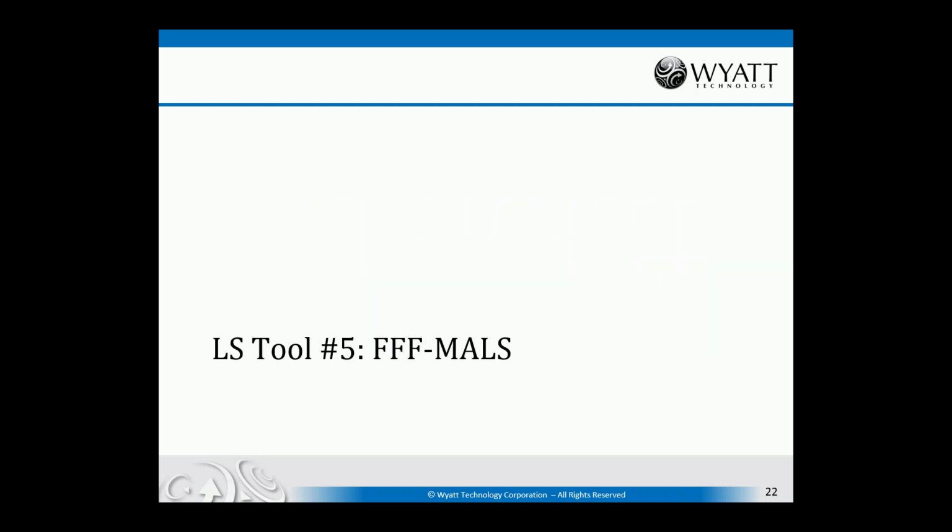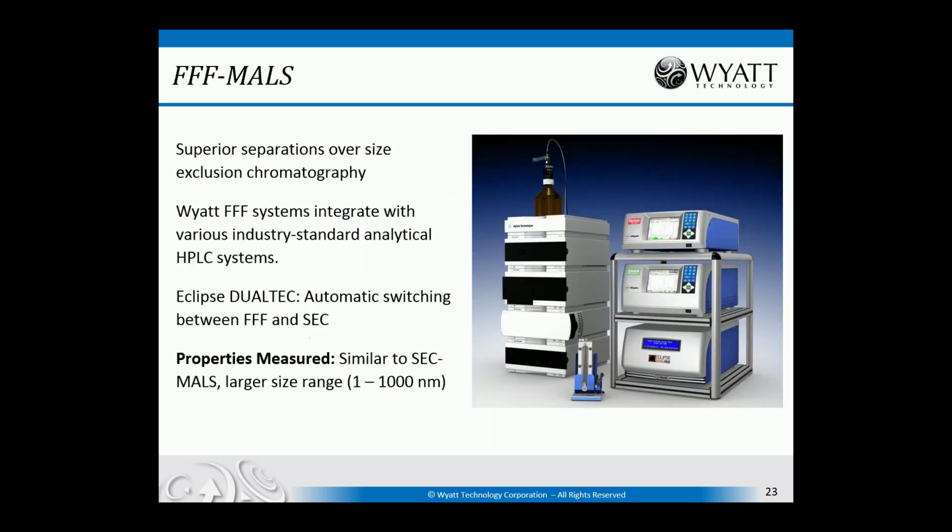Tool number 5 is FFF-MALS. It combines light scattering with field flow fractionation. Field flow fractionation is a separation technique that offers certain advantages over size exclusion chromatography, which I'll get to briefly. The Wyatt FFF system, called the Eclipse, integrates with industry standard analytical HPLC systems such as Agilent, Shimadzu, and Thermo Fisher Scientific.